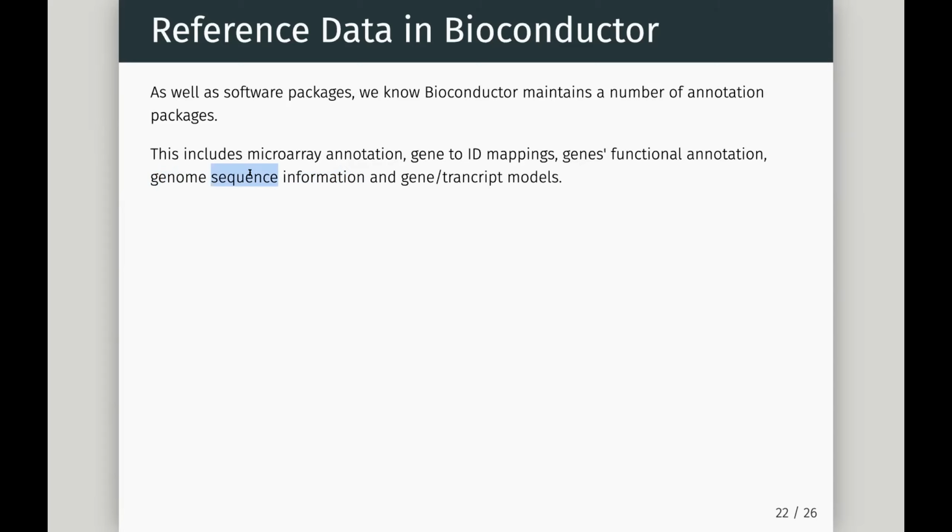So all this FASTA we described, which we can get from iGenomes, there are packages which actually maintain this internally. On top of that, we also get the equivalent of a GFF, our gene models, within this gene or transcript. We can also get those from inside Bioconductor too.